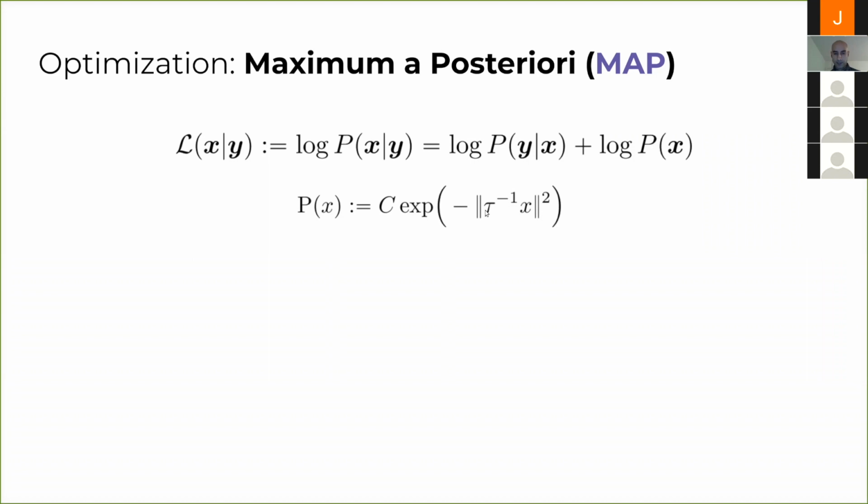In this case, it's an empirical prior, so it actually does care a bit about the data. And the way it cares about the data is this parameter here, the tau parameter. People that have used RELION are familiar with something called the tau fudge factor, which affects this parameter here. And what this parameter is, it's basically based on the FSC.